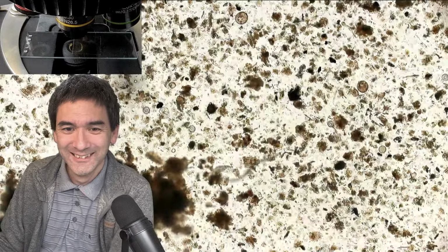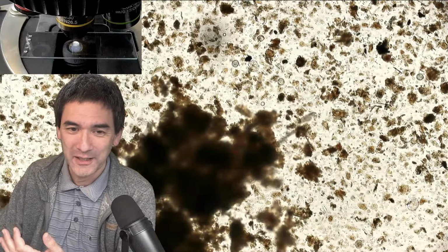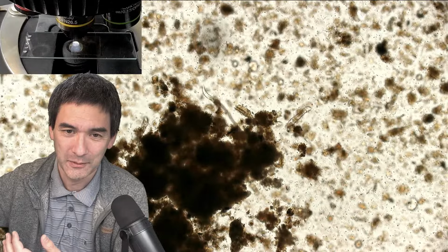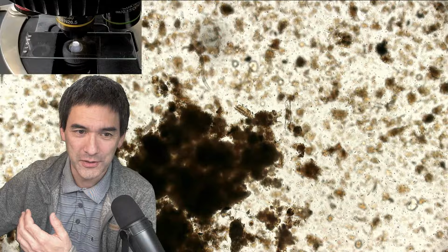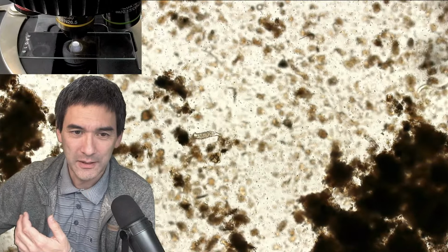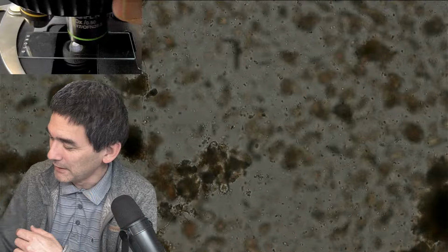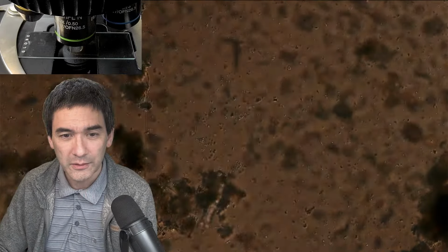So let's have a look here. At least something that's moving. Of course, a nematode worm, and something that looks like, I don't know, is it a rotifer? Okay, that's kind of weird stuff. But at least we can see that there is something moving. So I'm happy, because people like to see some moving stuff. Oh, that's way too dark.